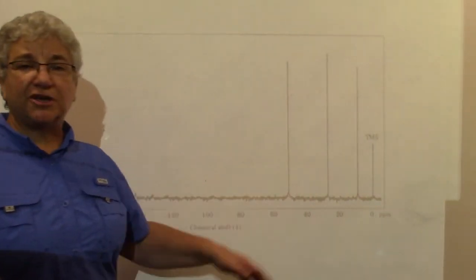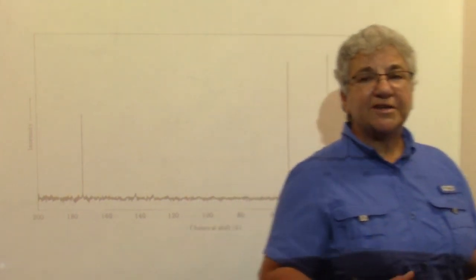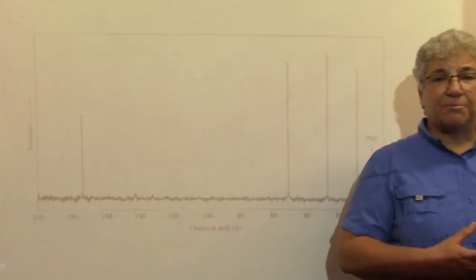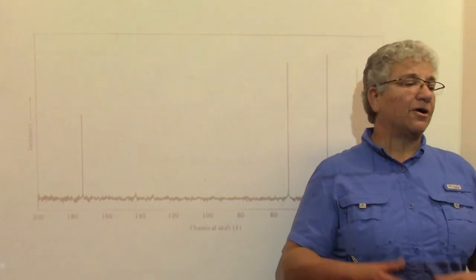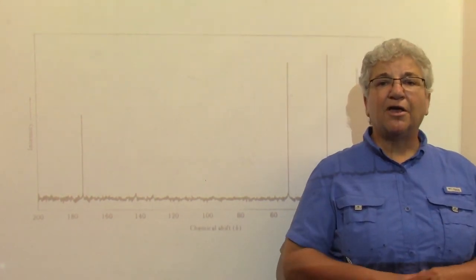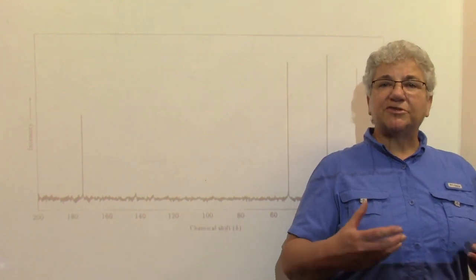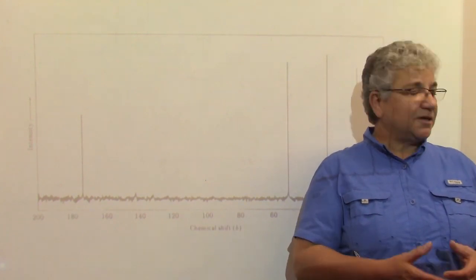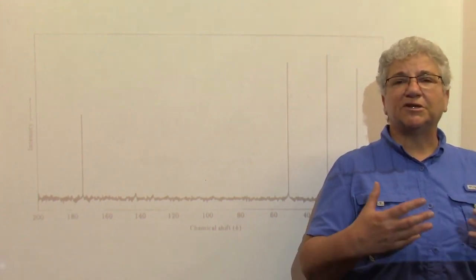What's the chemical shift, and what does that tell you about the structure of your molecule? So the reason NMR spectroscopy is so important is because if you have a proton NMR and if you have a carbon NMR, you really can use that information to figure out what the structure of your molecule is. It's really, if you interpret these things properly, really quite incredible.